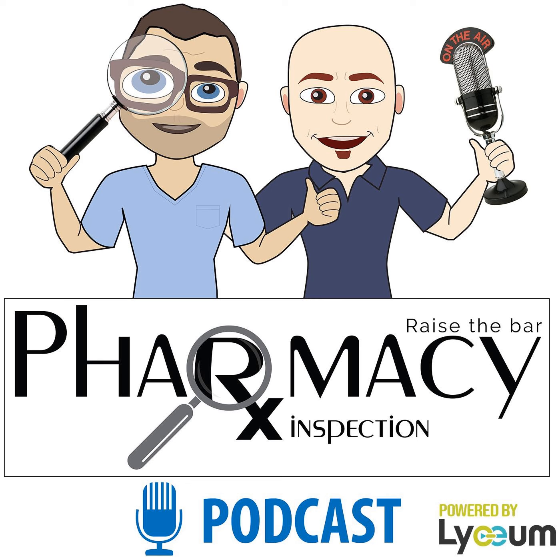Here are the action levels for viable airborne particle air sampling found in USP 797. ISO class 5, if you have greater than 1, you need to take action. ISO class 7, if you have greater than 10, and ISO class 8, if you have greater than 100. USP doesn't give too much direction on how to go about doing an investigation either.